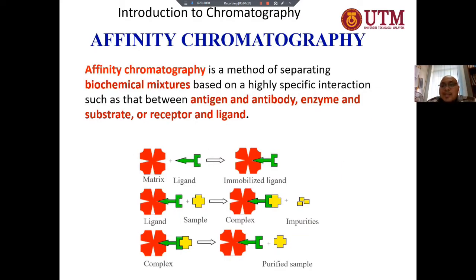The next one, we will learn about affinity chromatography. Affinity chromatography is a method of separating biochemical mixtures based on highly specific interaction, such as that between antigen and antibody, enzyme and substrate, or receptor and ligand.